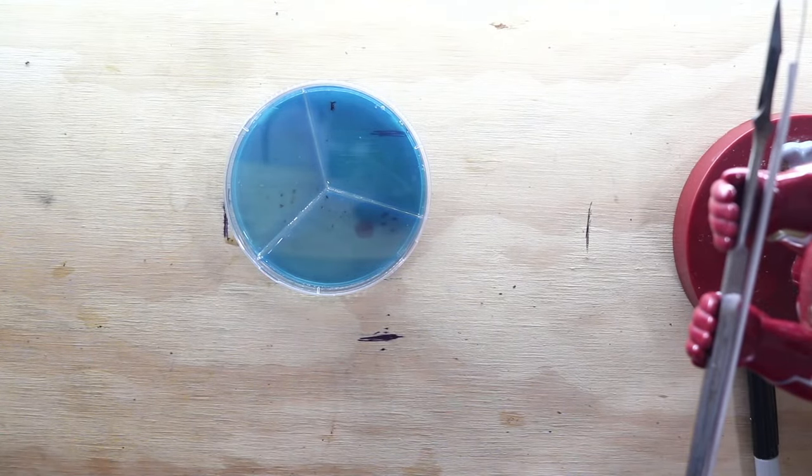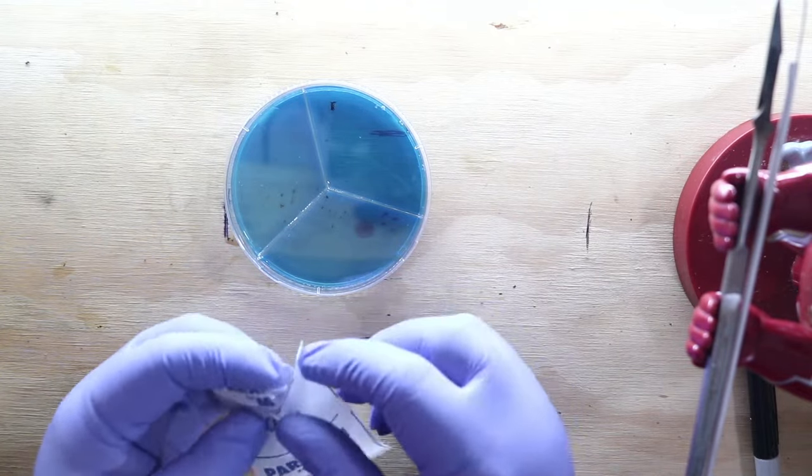Okay, so now that we have the liquid culture in the dish, all we're going to do is wrap and label it.